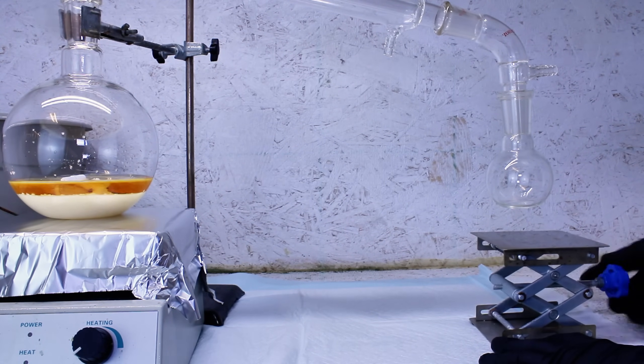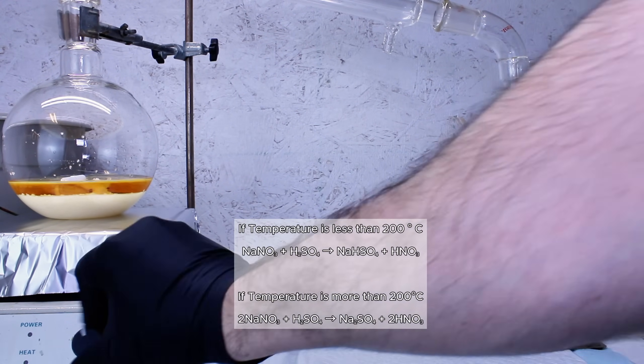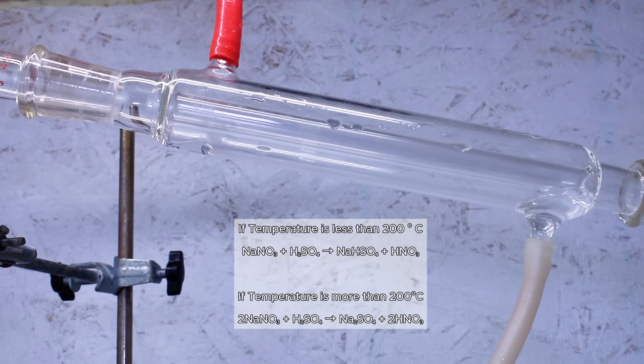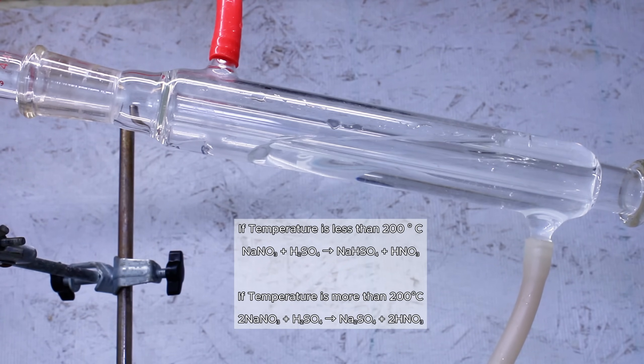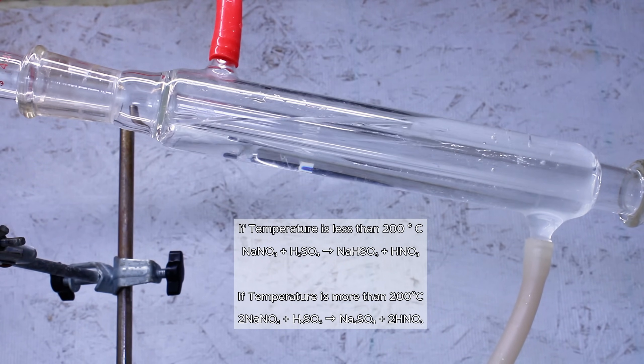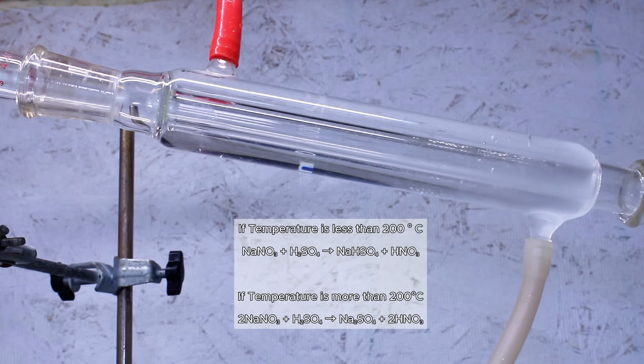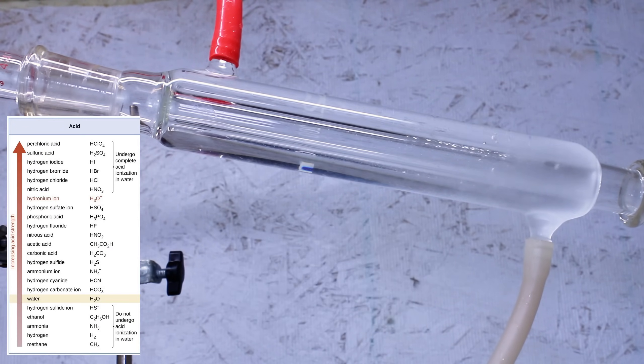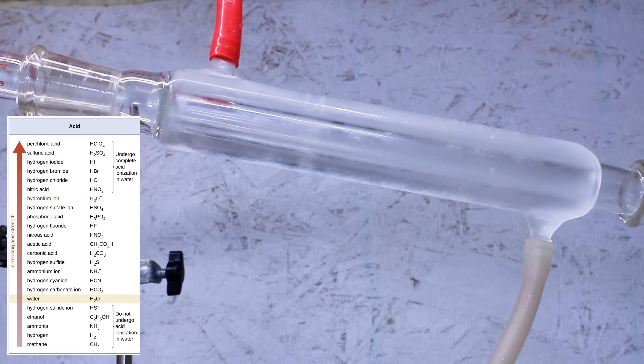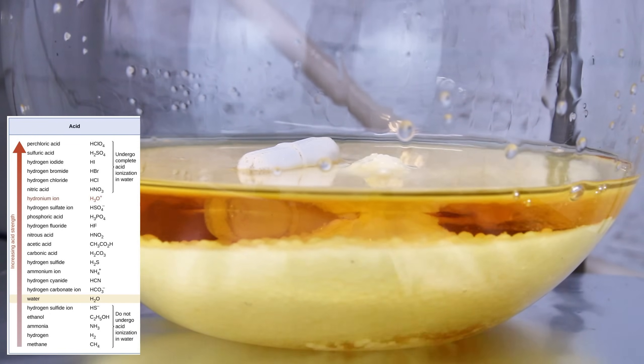If the reaction is conducted above 80 degrees Celsius but below 200 degrees Celsius, then the sodium nitrate and sulfuric acid will react to form one molecule of nitric acid and one molecule of the acidic salt sodium bisulfate. This happens because sulfuric acid is stronger than nitric acid, meaning that the nitrate ion has a higher affinity for hydrogen than the sulfate ion has for two hydrogen ions.